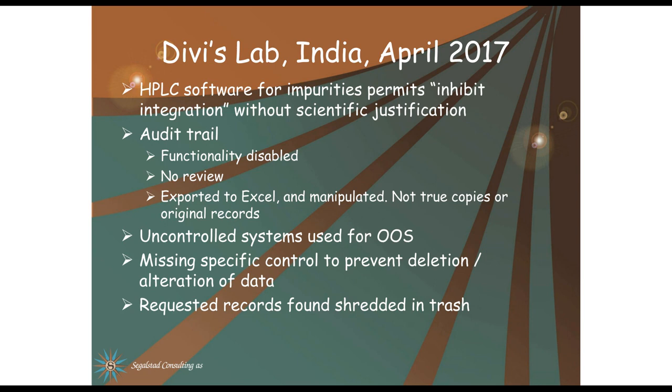To choose, you write your user requirement specification and send it out to the LIMS vendors, and you will get the answers back. The one that seems to fit your needs best is the best one for you, and your neighbor may have another one that's best for them.